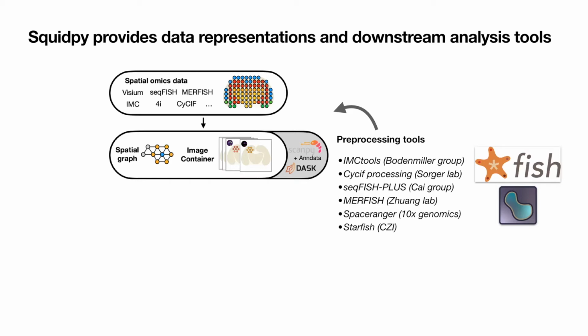And of course, knowing the actual number of cells that were imaged in a particular spatial transcriptomic spot is quite important for a lot of deconvolution methods, for example, or in general for downstream processing, to know how many cells you are actually looking at in your small spot.